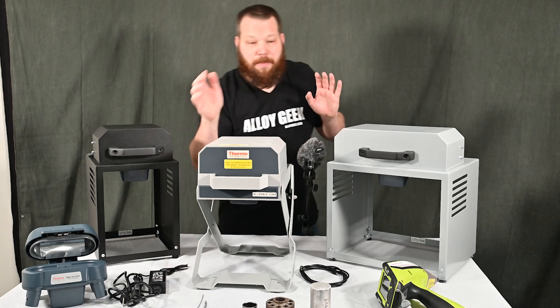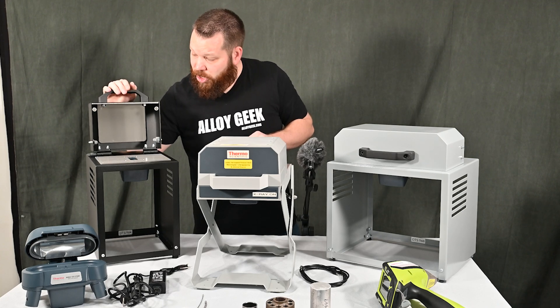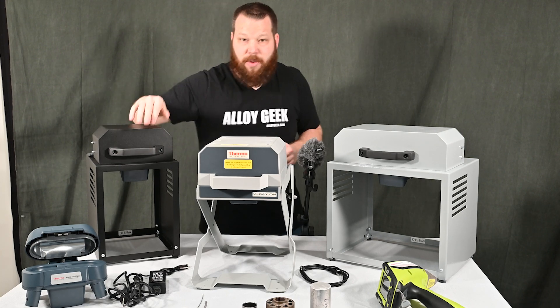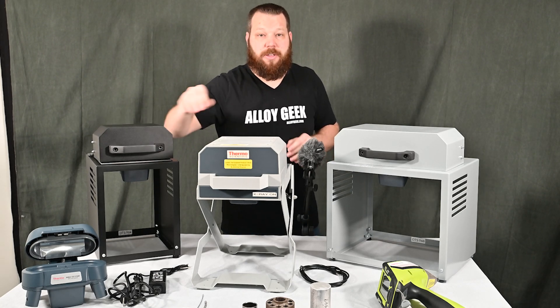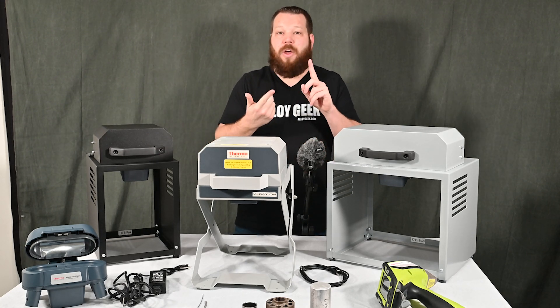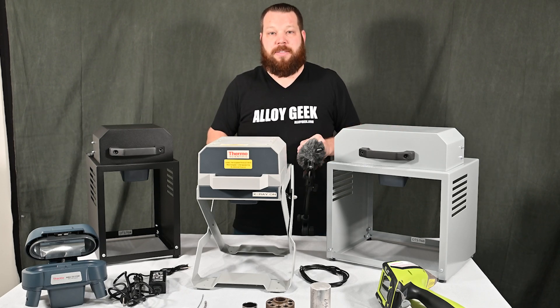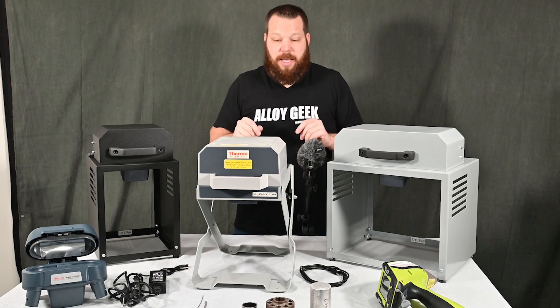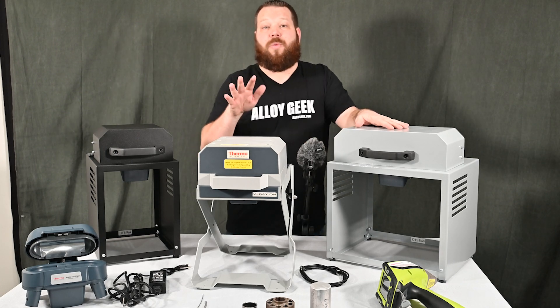Another reason is closed beam operation. We have chambers that are protected from x-ray, and when the XRF is clipped in, if somebody opens the chamber the x-ray turns off completely — totally safe. It removes your hands from dealing with small samples and is a great way to stay safe when using your handheld XRF.